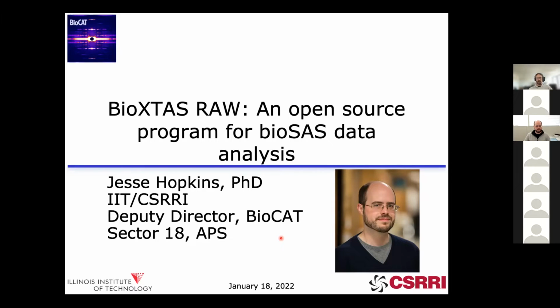And today we're fortunate to have Jesse Hopkins from BioCAT and Illinois Institute of Technology, who's here to talk to us about BioXTAS RAW. And Jesse's been working with small angle scattering for quite a while now. So with that, I will turn it over to you. And thank you for joining us today and for presenting.